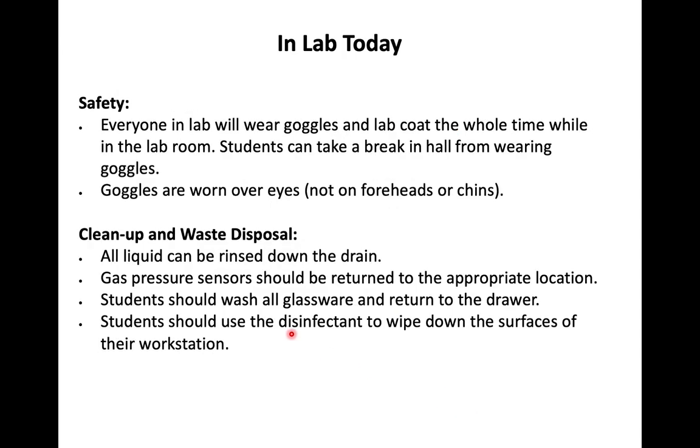So in lab today, safety is going to be what I say every week. Everyone in the lab will wear goggles and a lab coat throughout the whole time in the lab room. You can take a break in the hallway if you need to take your goggles off. Goggles need to be worn over the eyes and not on foreheads or chins. For cleanup, all we're using is air and water. So the liquid, which is just water, can be rinsed down the drain. Make sure the gas pressure sensors are returned to the appropriate location that you found them. You can wash glassware if it's been dirtied in the process, and you can use a disinfectant wipe to wipe down the surfaces of your workstation.